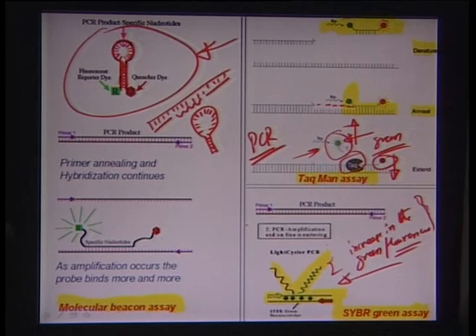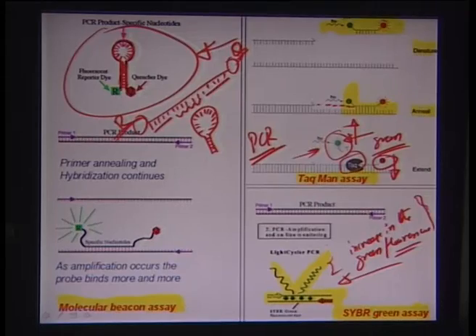How can we make a difference here? So, essentially if this DNA already had a reporter and a quencher molecule, a fluorophore and a quencher. Quencher is something which quenches the fluorophore, it tries to draw the emission spectra of the fluorophore, and essentially there is a preference of absorption over fluorescence. So a quencher with the fluorophore would mean that the quantum yield which is generated by the fluorophore is captured by the quencher and quenched essentially.